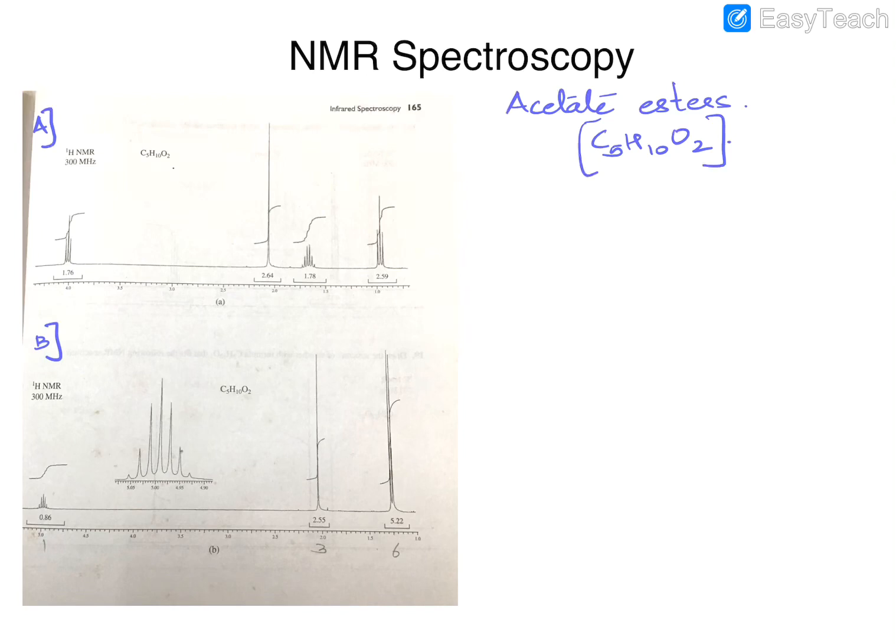Okay, to be able to do that, we are going to be using not only the chemical shift values, we are going to be using the couplings involved so as to determine the nearest neighbors, and then eventually we'll also be using peak integration. And in this particular spectrum, the J values haven't been given, but for more complicated structures whereby it is more difficult to predict which protons are the nearest neighbors, etc., then the coupling constant values can also help, because the coupling constant values are the same for two nuclei that couple one another. So that becomes a useful tool to decipher which are the two nuclei which are undergoing coupling.